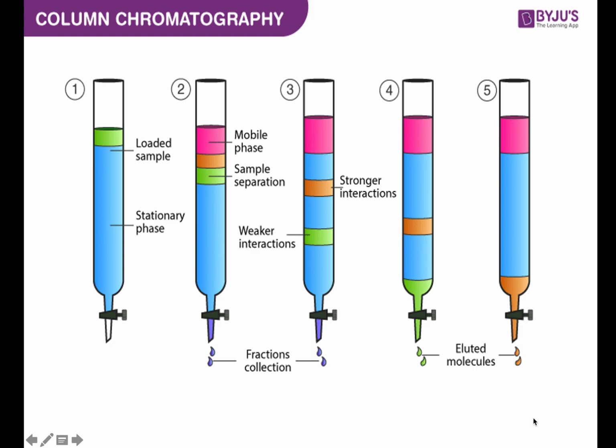Basically, in the last picture, which is photo 5, we eluted the desired product and undesired product separately. So in figure 4, we separated the green one from the orange one. The one we wanted, we separated, and the other one we can eliminate. How can we make sure that the green has completely separated from the orange one? We use TLC, thin layer chromatography. You have studied thin layer chromatography in your first semester.